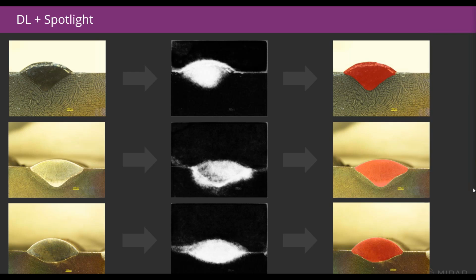So most of the application of segmentation in a 3D workflow like that is done at the slice level by, again, creating a recipe and then applying it sequentially to all slices. That said, after that workflow is done, there are direct 3D space manipulations that can be done in our 3D toolbox to maybe three-dimensionally ensure features are separated from one another, clean up boundaries, reject false negatives or false positives, things like that.